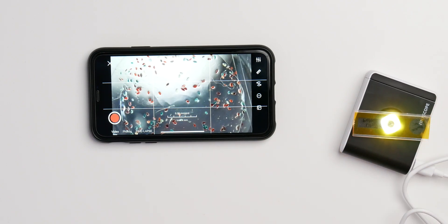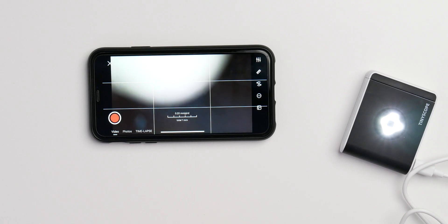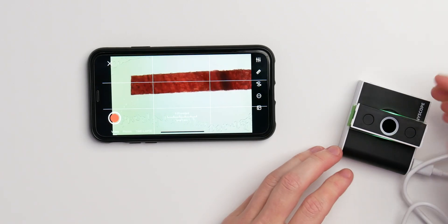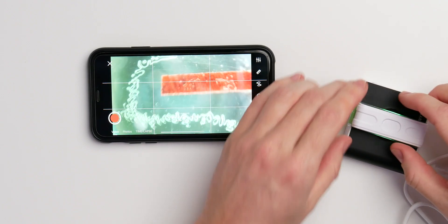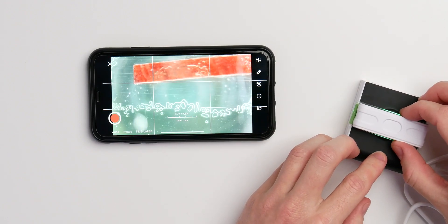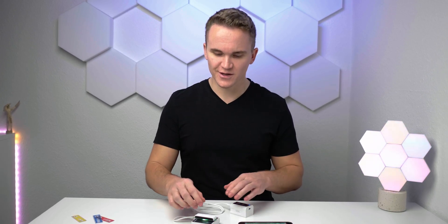And we have also this pollen over here. They look like this. So in my opinion super fast. We have this white backdrop and you can also switch it around and have the black one as well. In my opinion, really, really cool.